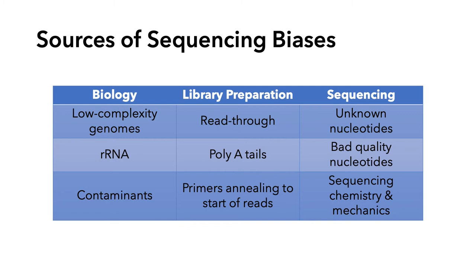Each of these problems — sources of bias from biology, library preparation, and sequencing — leave characteristic signatures in the data. One of the most popular tools for detecting sequencing bias is FastQC. I'm going to run you through each of the FastQC modules, pointing out how to detect these problems in your data.